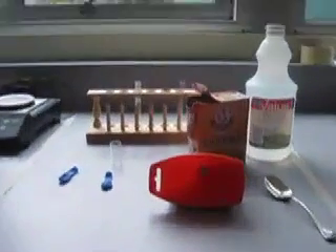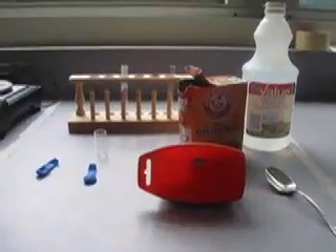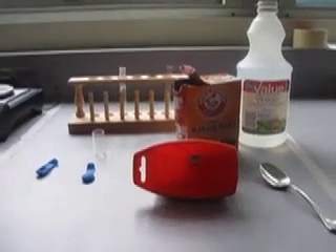Welcome to my lab. This is my lab — a little bit of end-of-year looking, a little bit of a clutter fest. Today I'm going to do a little bit of a demonstration for you about the law of conservation of mass.